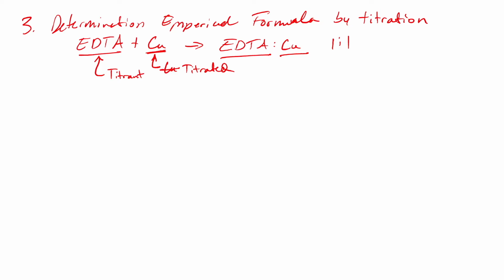So what that means then is that when you have your burette, like so, and here's my stopcock right here, and then my little stopcock knob, and then my little spout, and then I have my little flask down here to catch the titrant.